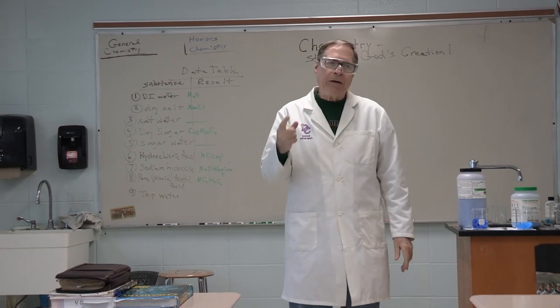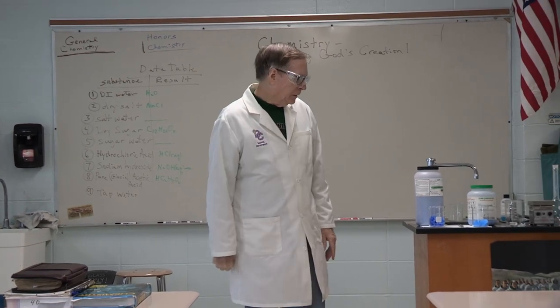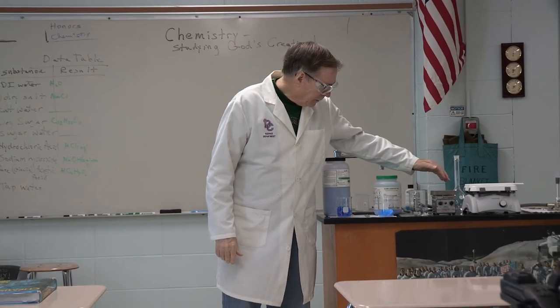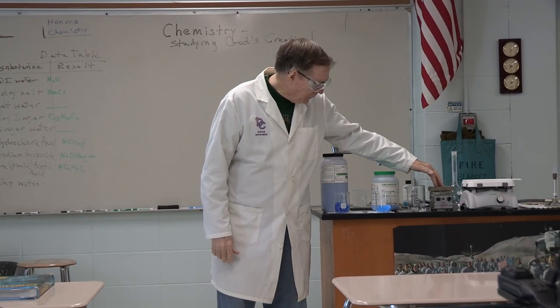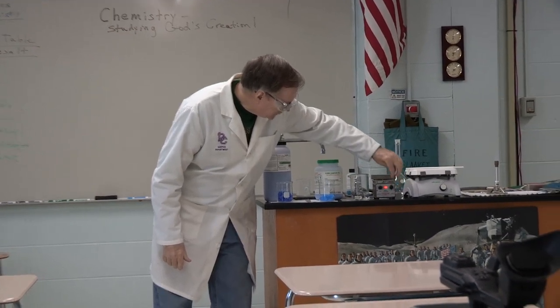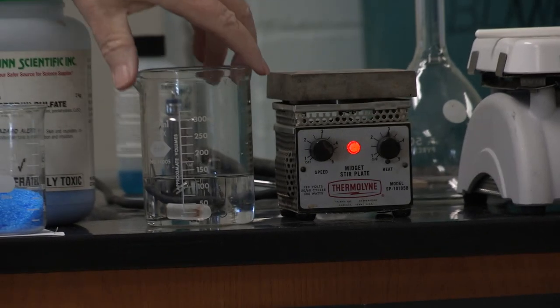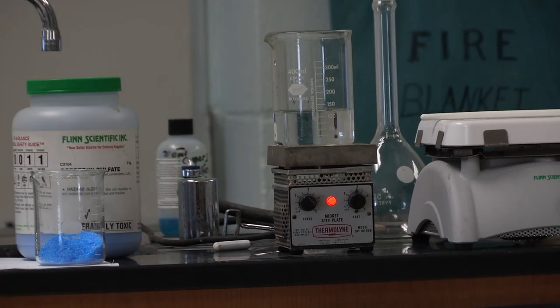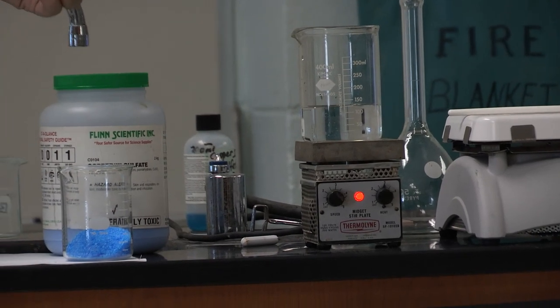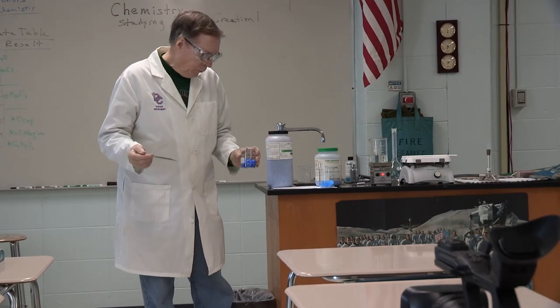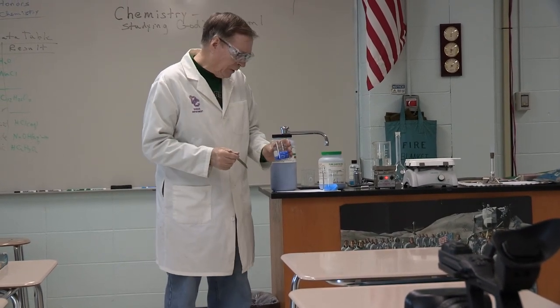So we said there are three factors: heating, stirring, and surface area. Here I have a stir plate that also has a heater on it. If I turn this heater on, you can see the red light comes on when the heater is working. I could take some of my crystals, put them in solution, and turn the heater on, and they would begin to dissolve more quickly than if I just left them at room temperature.